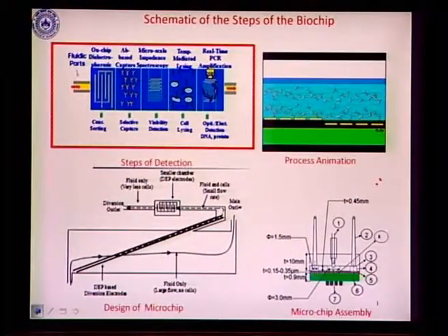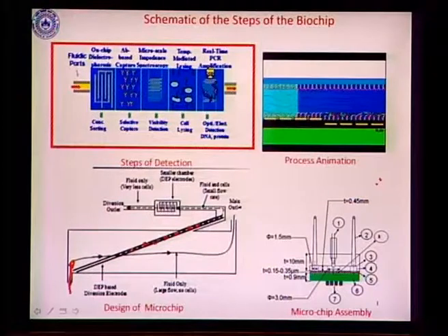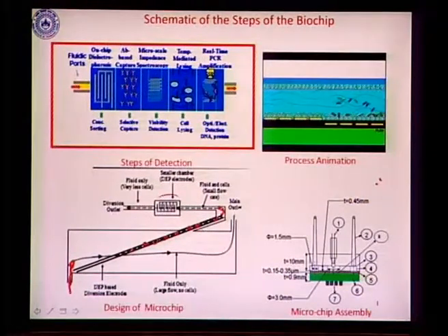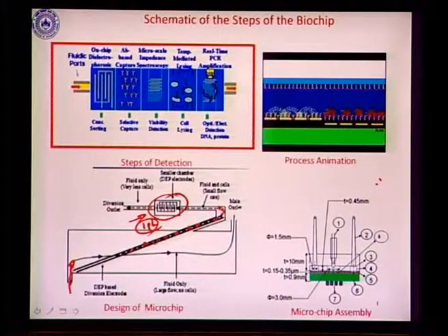The way you actually do this identification is essentially by flowing the cell samples here and using these diverging electrodes to pull off the cells and pack them selectively onto the smaller channel here, so that you can super concentrate the cells in this small chamber. Now, this is only about close to 1 picoliters in size, it is a very small chamber. So, all the bacteria is concentrated here, and there is this set of electrodes which would actually try to capture the bacteria and align it with these particular electrodes, and this is the diversion outlet from where the water carrying or the media carrying the bacteria is let out, and it is a continuous fluidic circuit this way.